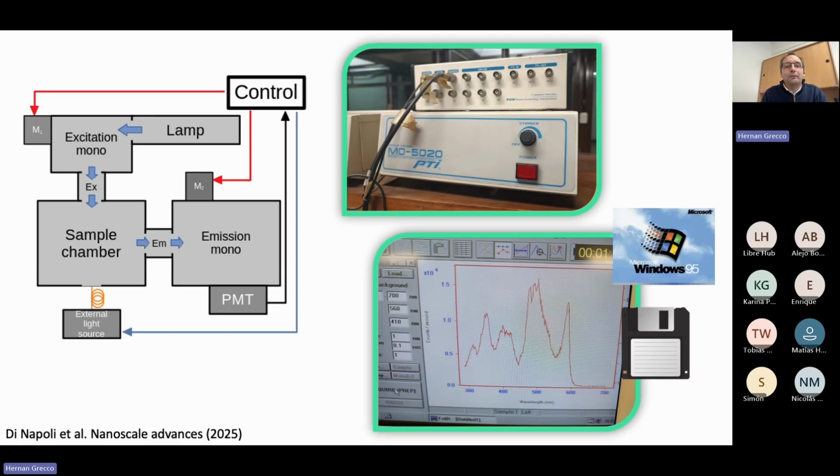Yeah, for those of you who are very young, this is not the save button. This is actually a place in which you were storing your data to transfer to another computer. So that device that we have in our School of Science was having this type of very old electronics and very old software. But the device was great.